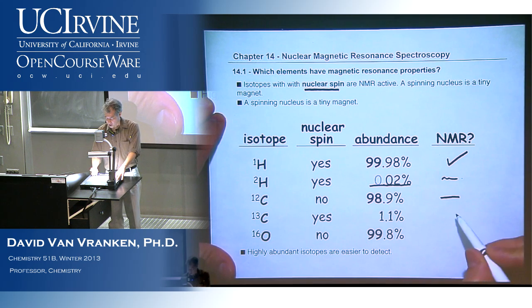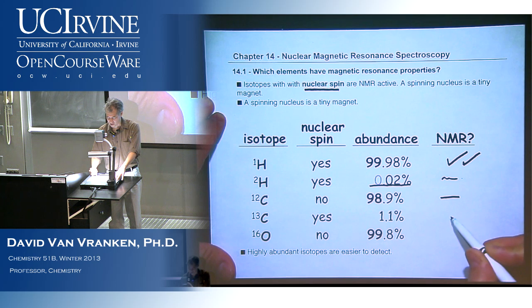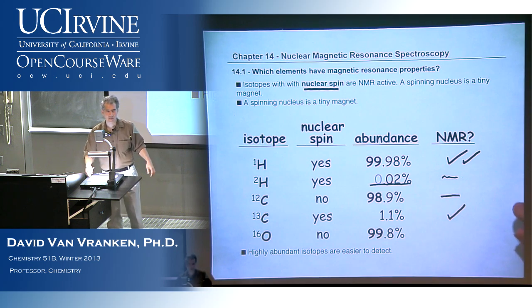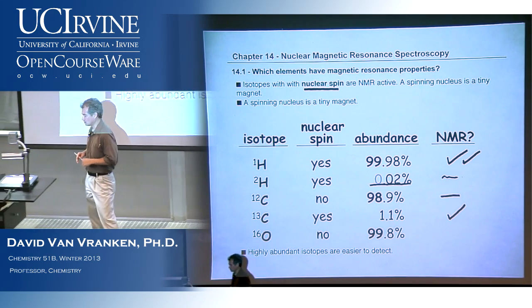You can't distinguish them by doing some kind of chemistry. So you can do NMR. It's not as sensitive. Let me put 2 checks here near proton because it's so sensitive. You can do carbon NMR, but you've got to, again, jack up the power in order to see the tiny amounts of carbon that are there, because on average, so few carbons are actually C13.